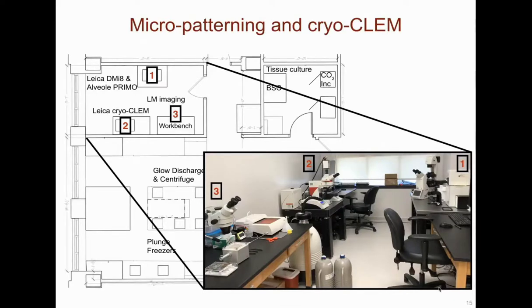Each microscope is on an air table to dampen vibrations. The systems are housed in close proximity to incubators in the tissue culture labs, as well as the plunge freezing instruments, thus making transitions between the culturing, imaging, and sample vitrification steps seamless.